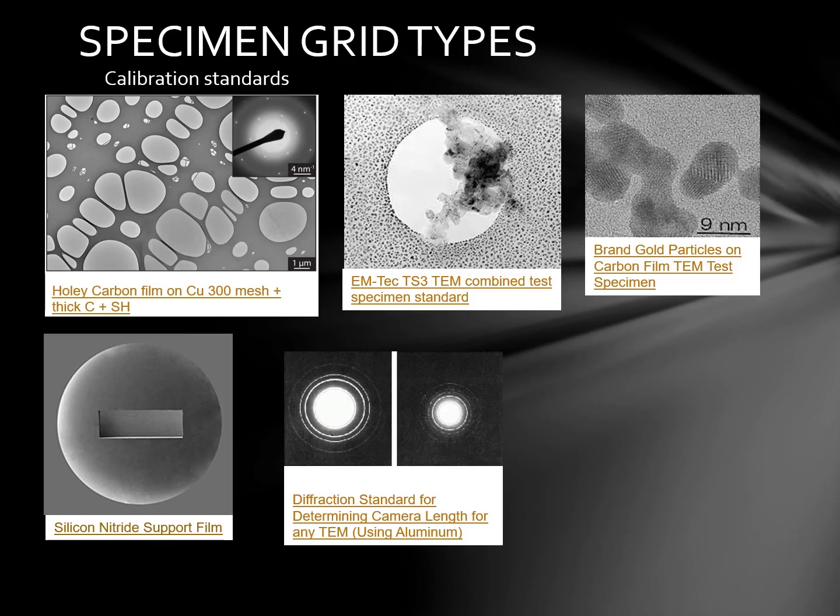Now I would quickly like to mention calibration standards. You get various types like lattice plane specimens and perforated carbon films that help check the microscope resolution, astigmatism, and microscope stability. There are many types of calibration standards for STEM, especially for STEM magnification, diffraction, and X-ray analysis.